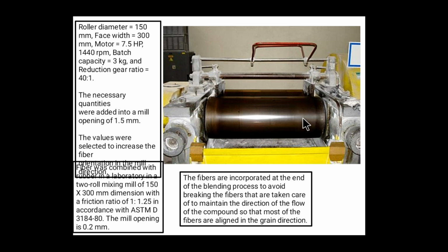The rolled sheet was then passed through a tight nip gap, earlier 1.25 mm, then 0.8 mm at the end of the lap of 6 to 7 times, and finally a 3 mm nip gap.